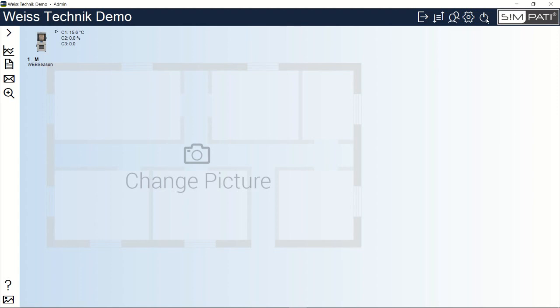The data logging, the chamber operation, the remote access will not work if SIMPATI is off. So many customers just leave this on a separate workstation to allow the remote access, the data logging to continually operate. And with that, I will close today's video.